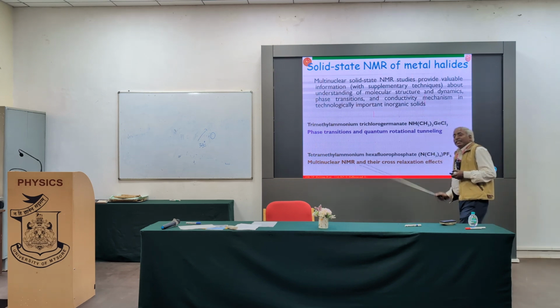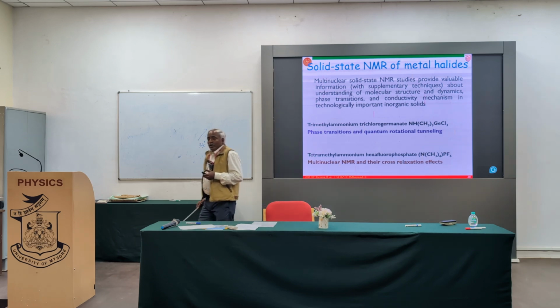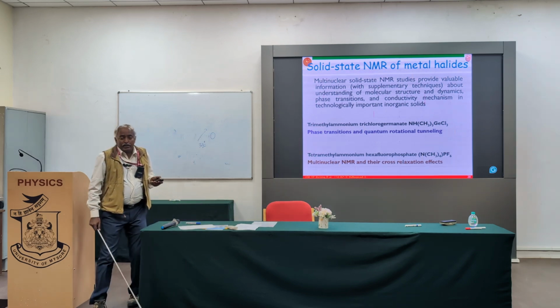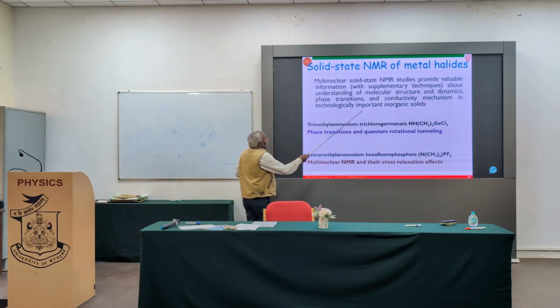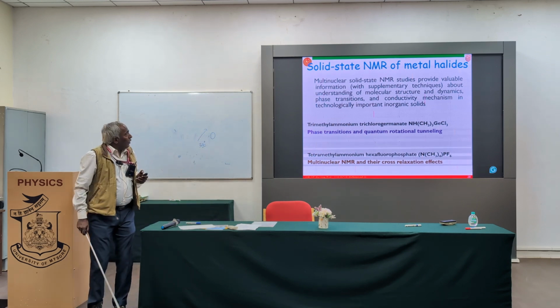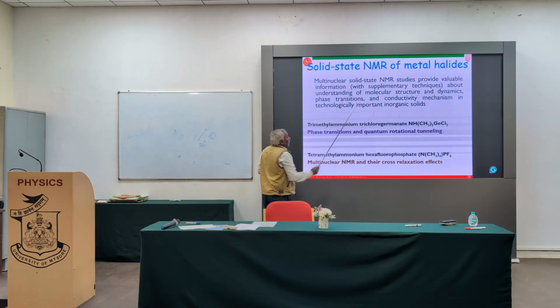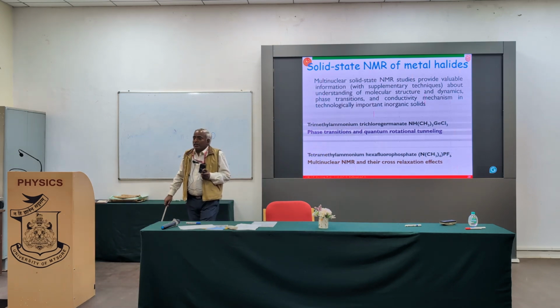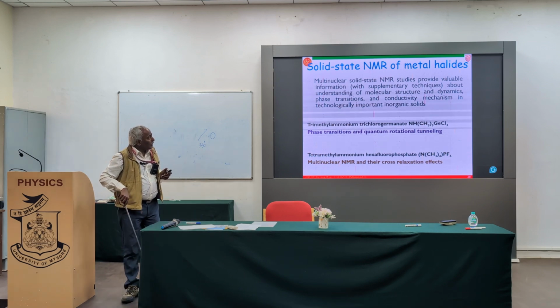Along with that, any possible phase transitions present in the given system can be identified with this NMR relaxation data, and also whatever conductivity mechanism is happening in the system can be captured. All these are important for any technological applications. Hence, all the details can be captured using this solid state NMR spectrometer.